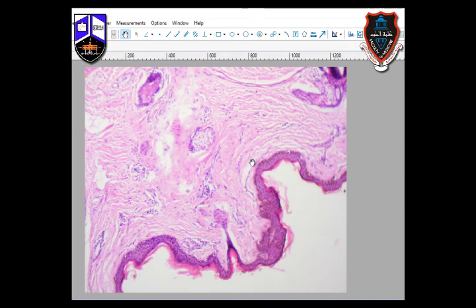You can see here the wavy fibers of the collagen are arranged in many directions, and they exceed the number of the cells of the connective tissue. So in the dense irregular connective tissue, there is a small ground substance and more fibers and less fibroblast.